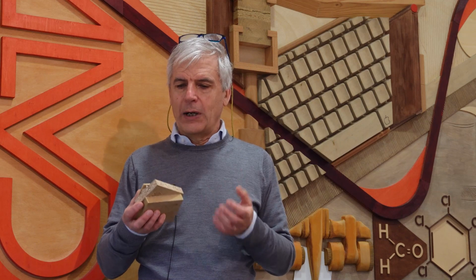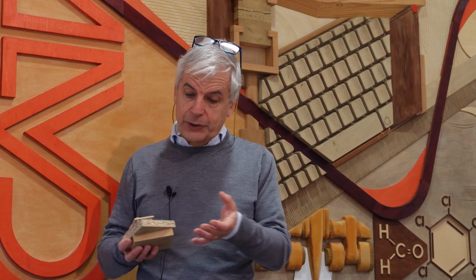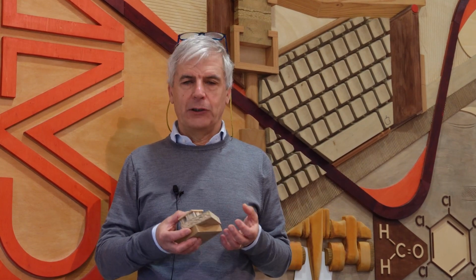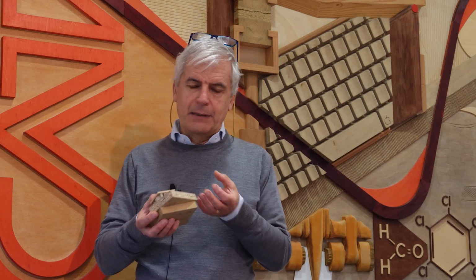Today we're going to look at some of these verification processes, tests that have to do with the mechanical properties, for example, resistance to deflection, density profile, tensile strength, a number of characteristics that are important for the finished product. Today we are also going to look at some other aspects that have to do with the composition of timber panels.